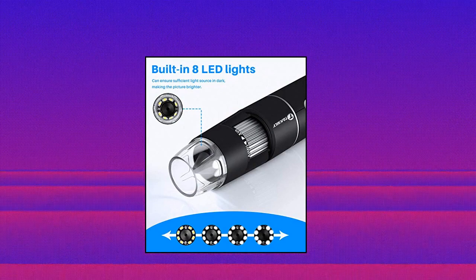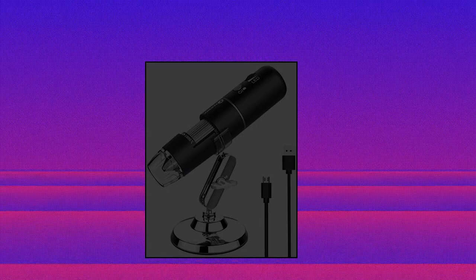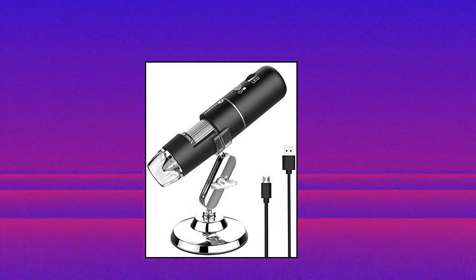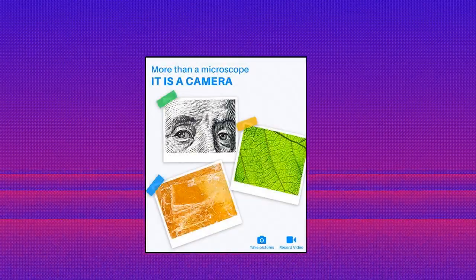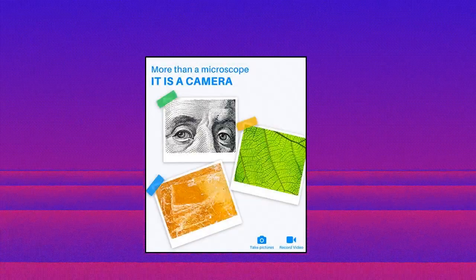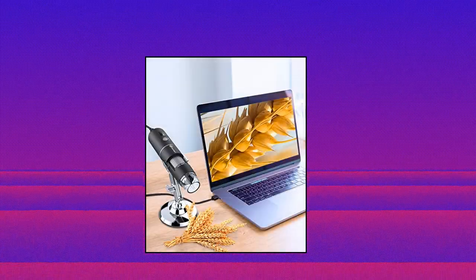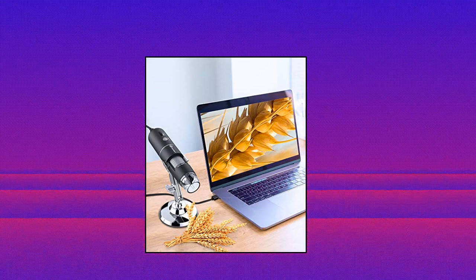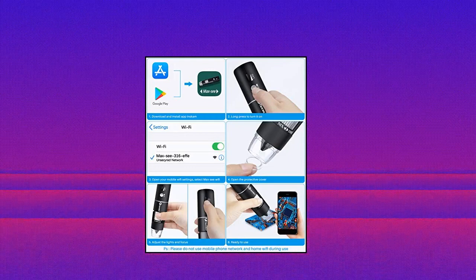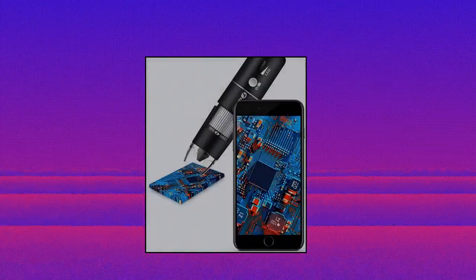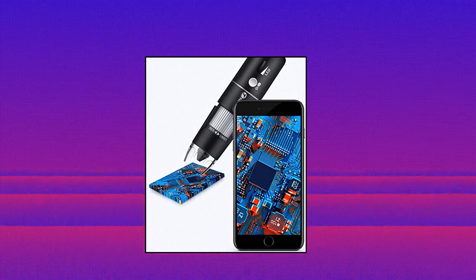Wireless Digital Microscope Handheld USB HD Inspection Camera 50x-1000x Magnification with Stand Compatible with iPhone. App Provided Optional Software for iOS, Android, Windows, Mac OS X. This microscope can support Android 6.0, iOS 9.0 or later, Windows Vista 7-8-10-11 or later, Mac OS X 11 or later. Magnification and High Definition: 2 Million Pixels, 1080p HD Picture Quality for Smartphone, 720p for Computer. 50x magnification can meet your daily needs. Built-in 8 dimmable LEDs provide enough illuminance.